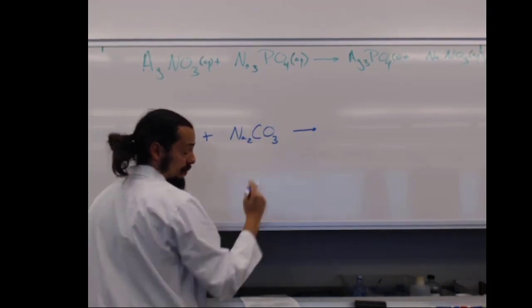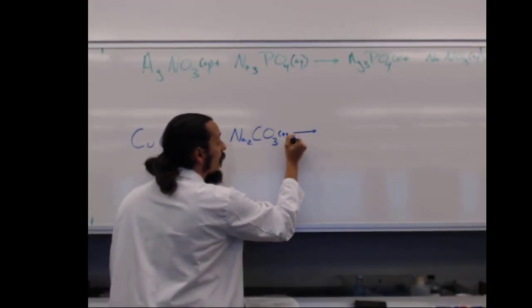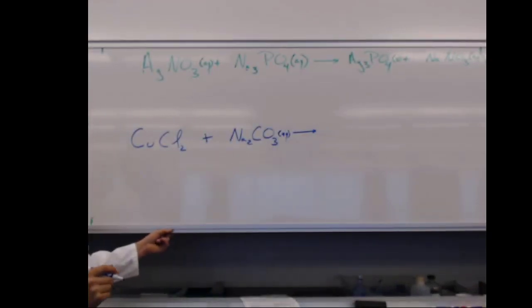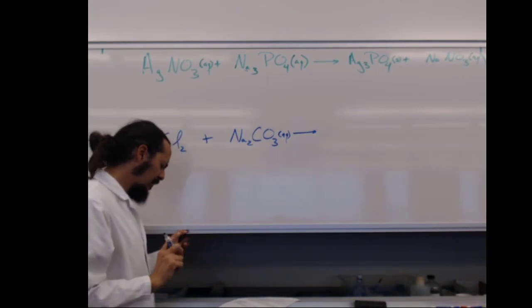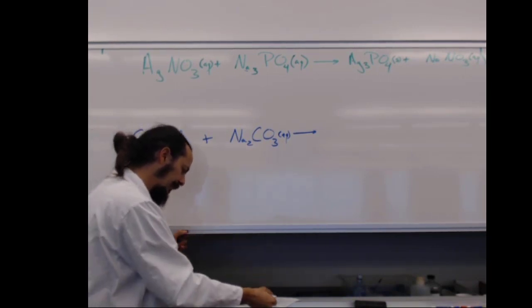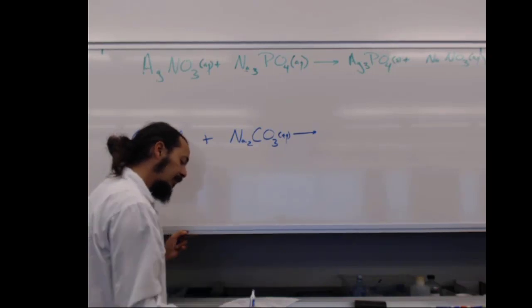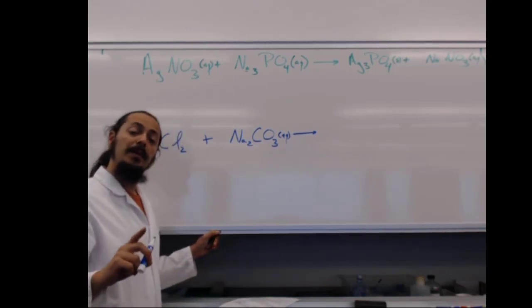Sodium compounds, soluble, one to remember, right? Gives us a lot less to look up if we remember sodium compounds are soluble. Copper and chlorine compounds, though, those aren't easy to remember. So we're going to look at our rules. And rule number 3 says chlorine, bromine, and iodine are typically soluble.